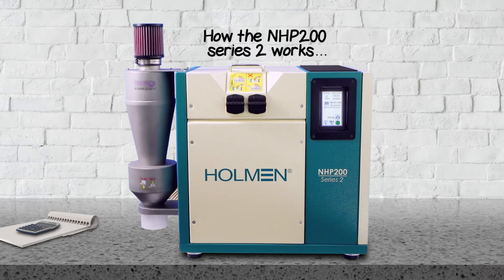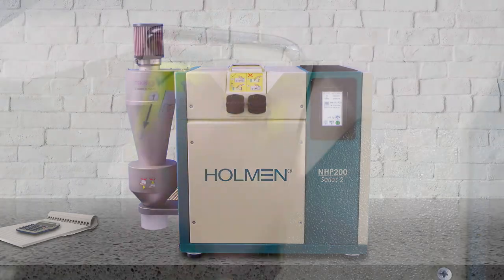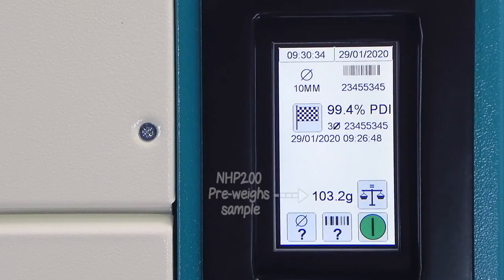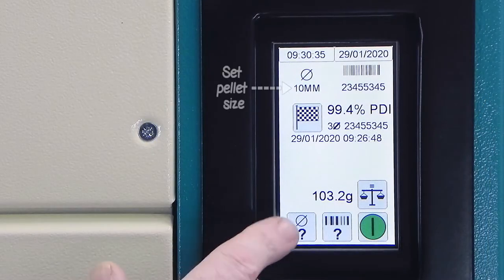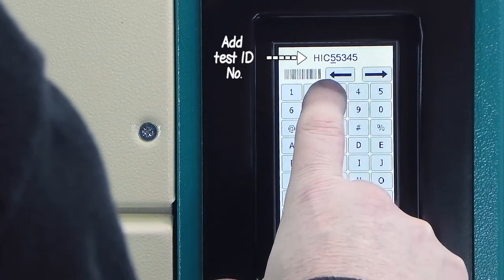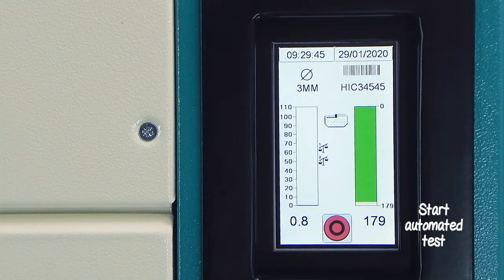How the NHP 200 Series 2 works. Your staff load the pellet sample into the machine. It automatically pre-weighs the sample. They then set the pellet size and add the test ID number. After this, everything else is automated to ensure test consistency.